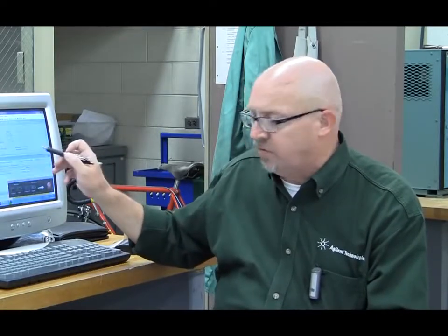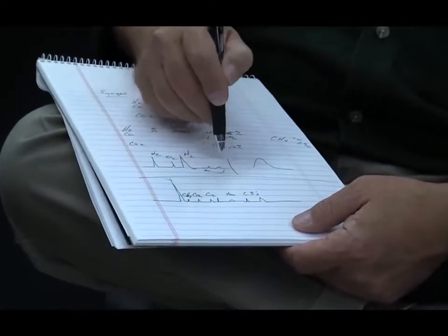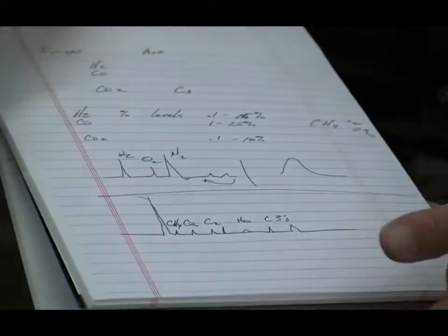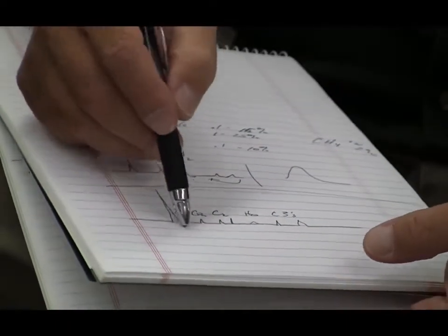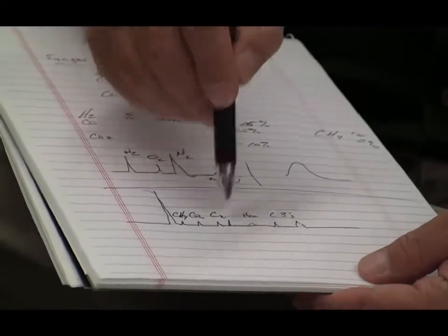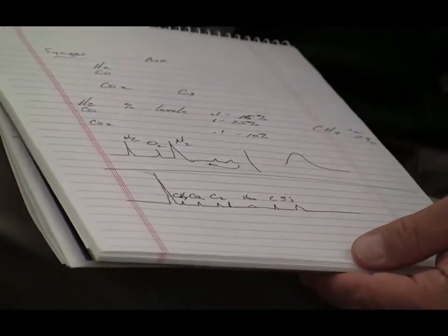It'll be named and they'll be done by retention time, but this should always hold true because the retention time is going to be set by whatever we set the pressure to be on the column. So we're going to see helium, hydrogen, oxygen, nitrogen, then methane and CO. On this other one, we're going to see an air peak, or a composite peak, that we won't analyze. We probably won't analyze methane, we'll probably do it on the other one. And then we'll start at CO2, C2s, C3s. If there's water, it'll be right in between the two of them. And water is a distinctive peak.